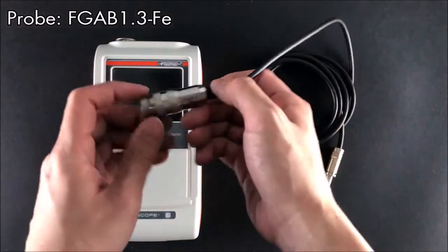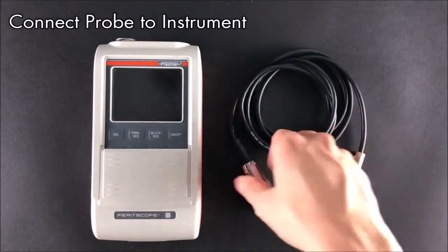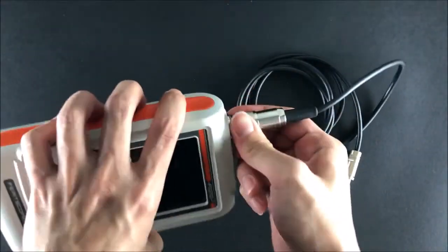First, connect a probe. The FGA B1.3 FE is capable of measuring both delta ferrite content and alpha martensite content in steel substrates on flat and curved areas.